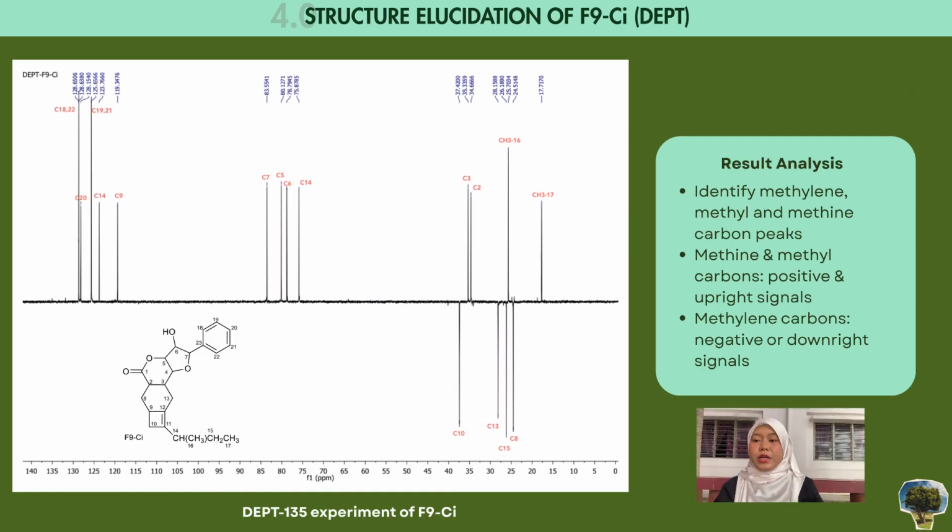This is the DEPT NMR spectrum that helps us to identify and differentiate between methylene, methyl, and also methine carbon peaks. In this experiment, methine and also methyl carbons show positive, upward signals. Meanwhile, the methylene carbon peaks show downward, negative signals.